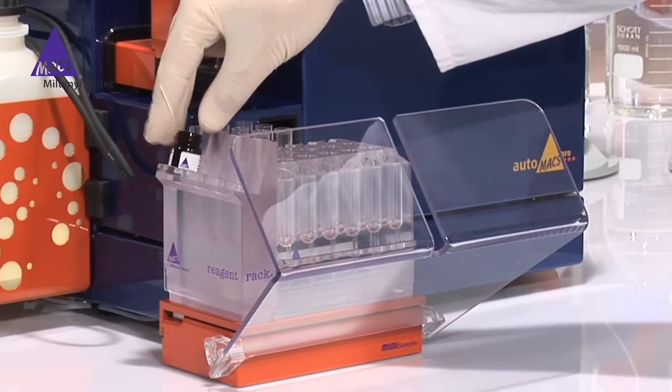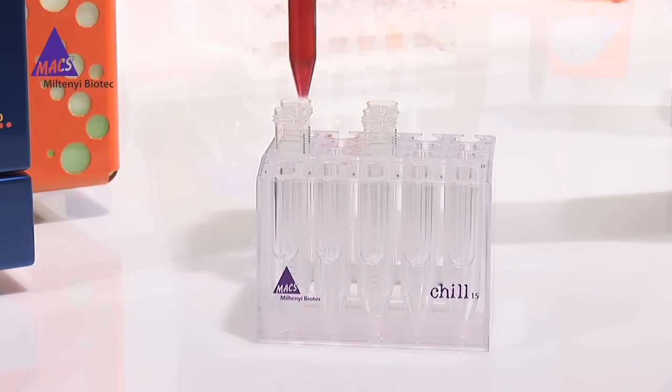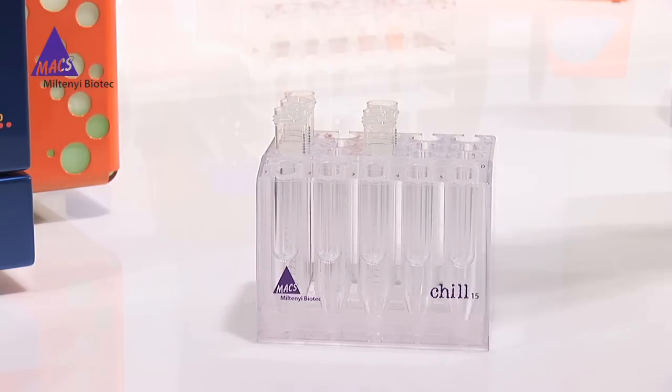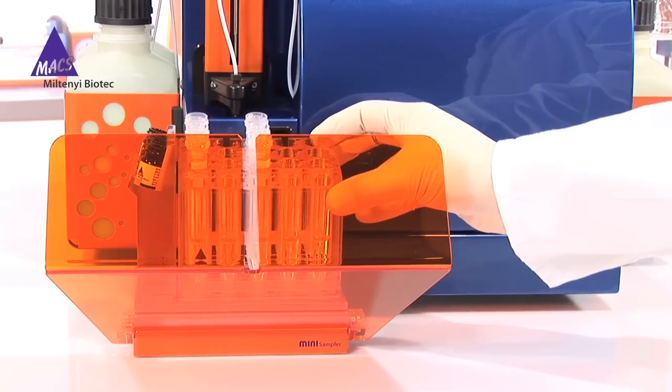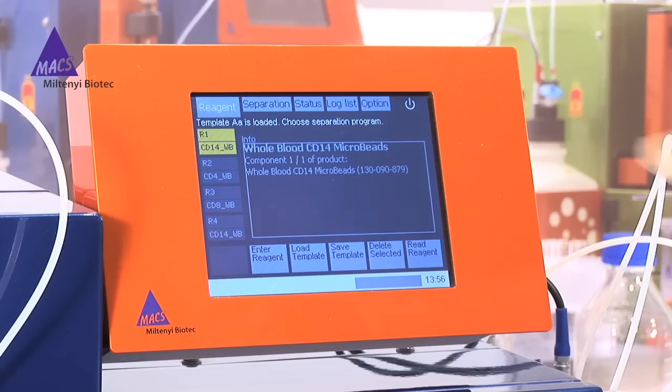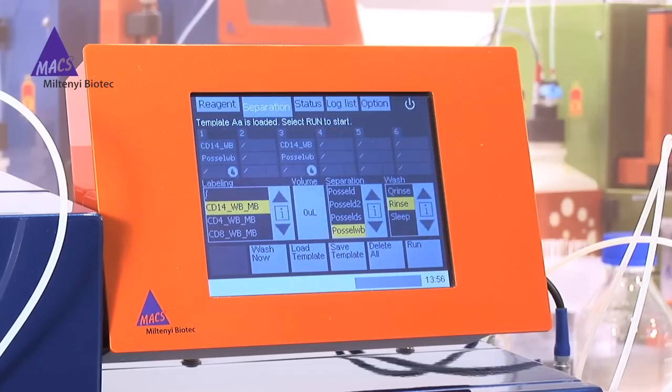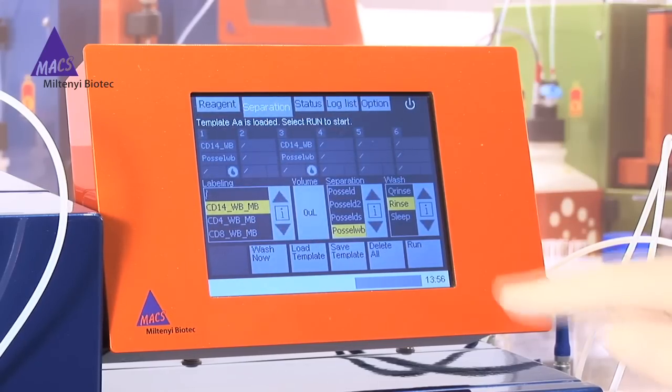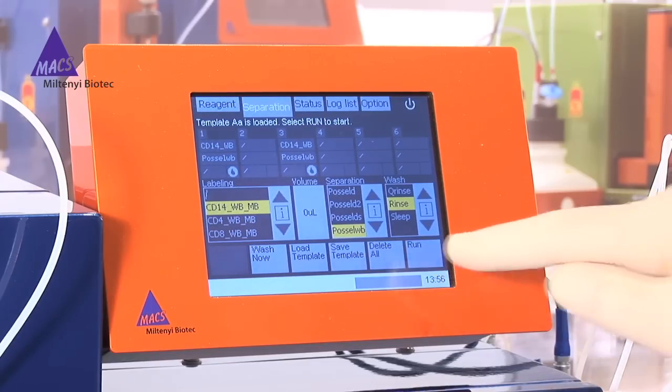Second, place your whole blood samples on the chill rack and designate the separation sequence. The instrument will handle labeling and select the best separation protocol and wash program. Third, press run to start walkaway cell separation.